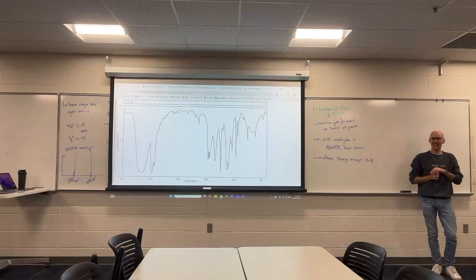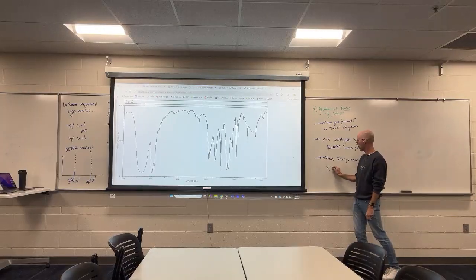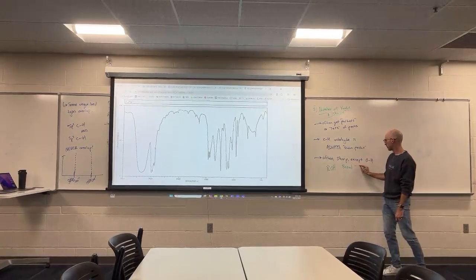Yeah? Because of hydrogen bonding, we get these broad OHs. The OH of an alcohol shows up broad, typically like this.